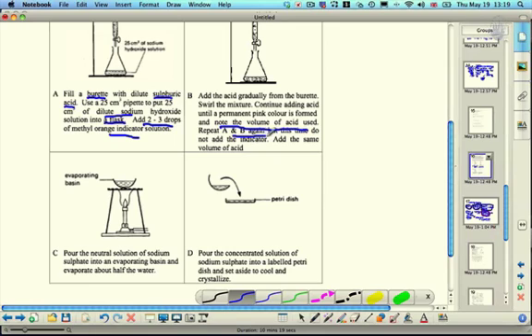Repeat this again, but this time do not add the indicator. If you added the indicator and you evaporated it off, you would have indicator in your French fries. Not good again, might be poisonous. So this time you do it again without the indicator, evaporate off to get you the salt, and leave your crystals to form. They'll crystallize as they cool down.